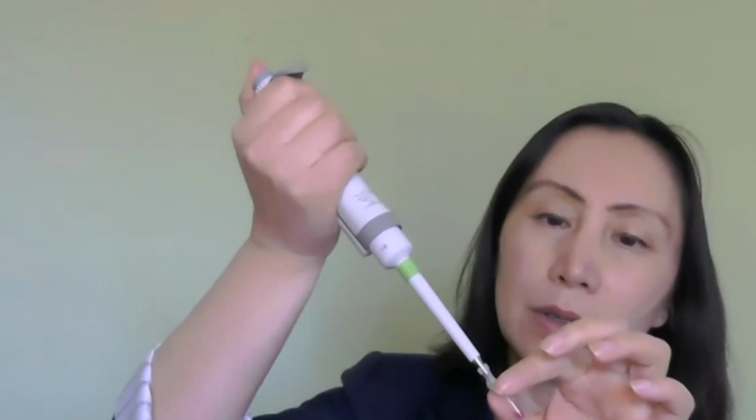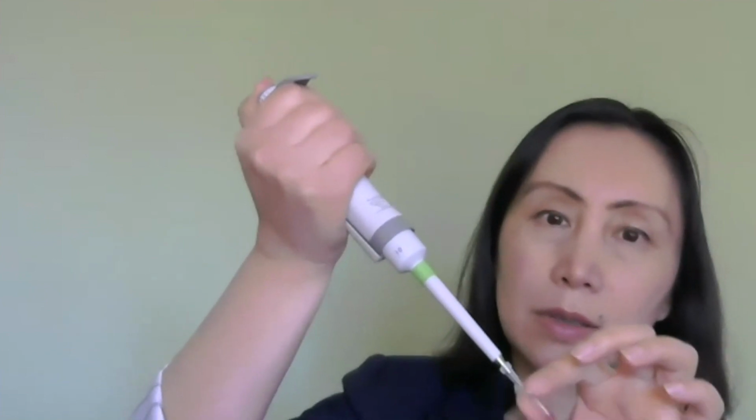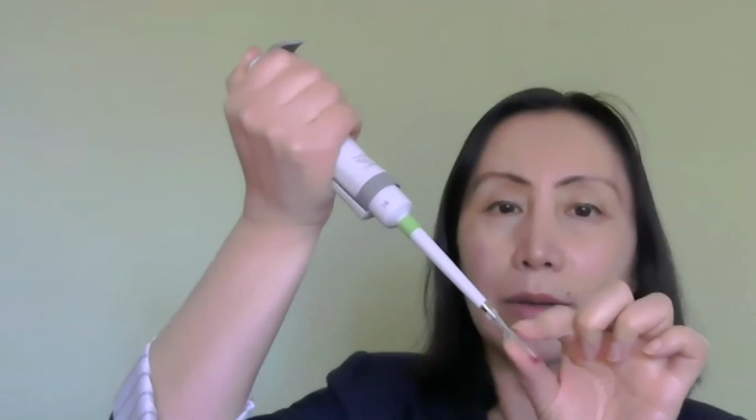And I will add it into the original PCR tube here. Press down to the second stop, and then come out, change the tip and close it. And I will label this with the letter D. D means digested.